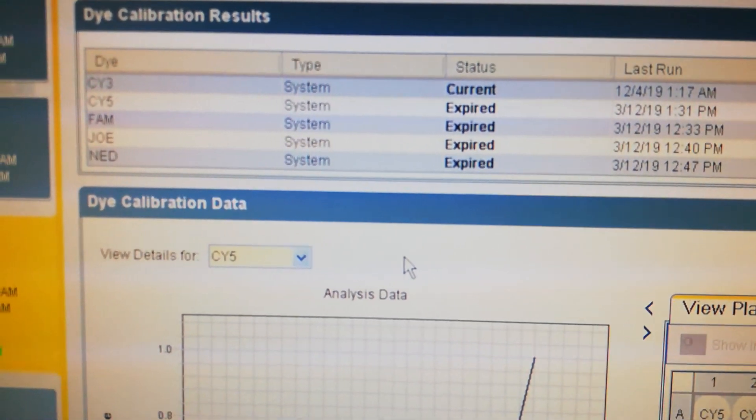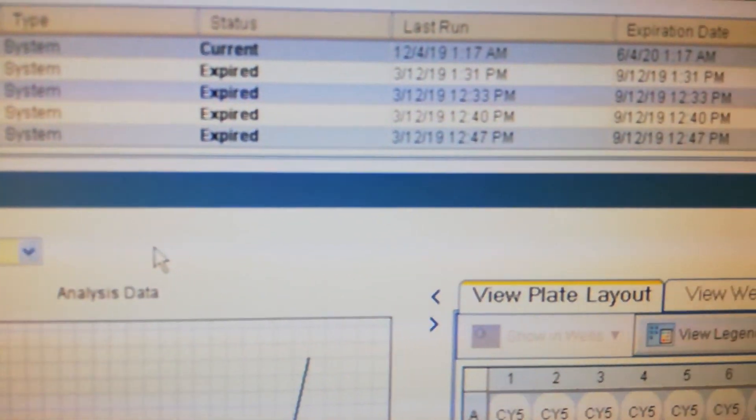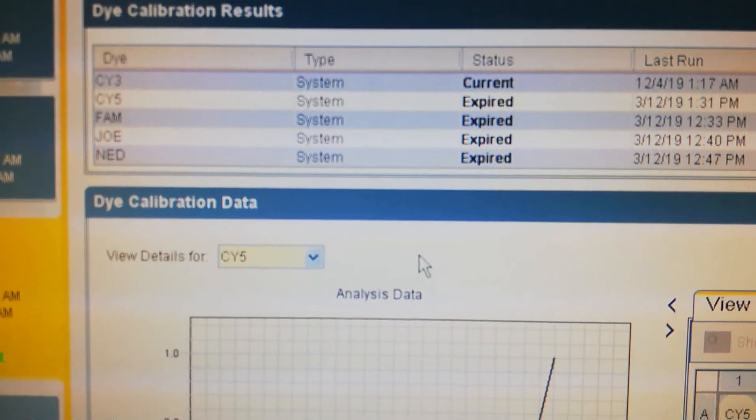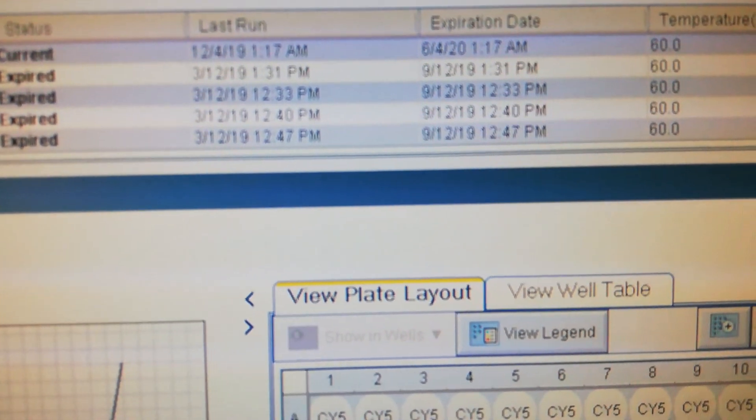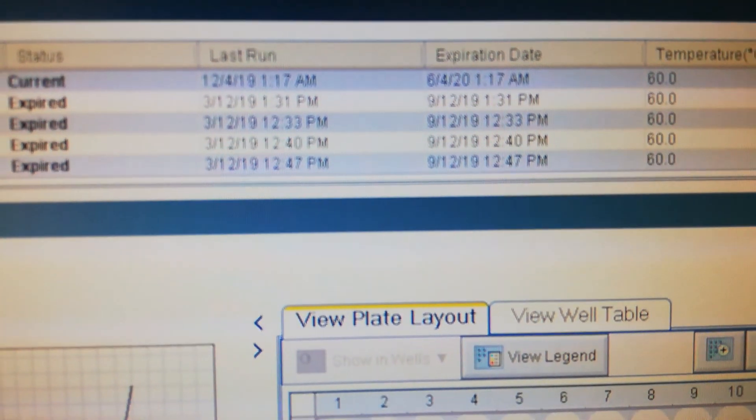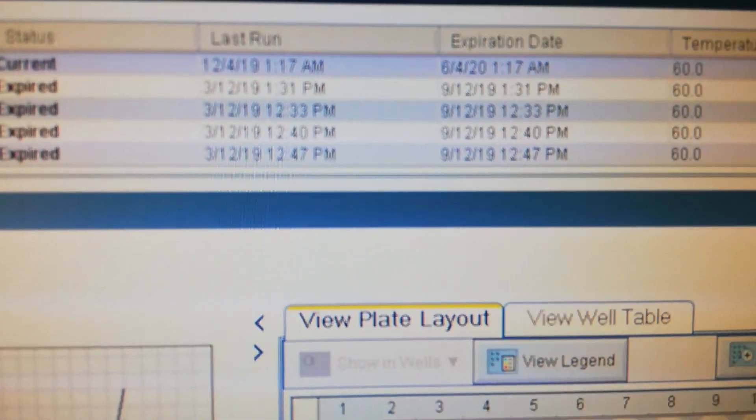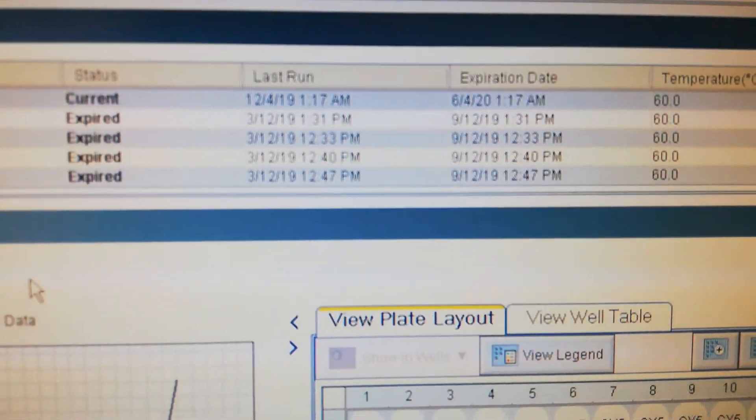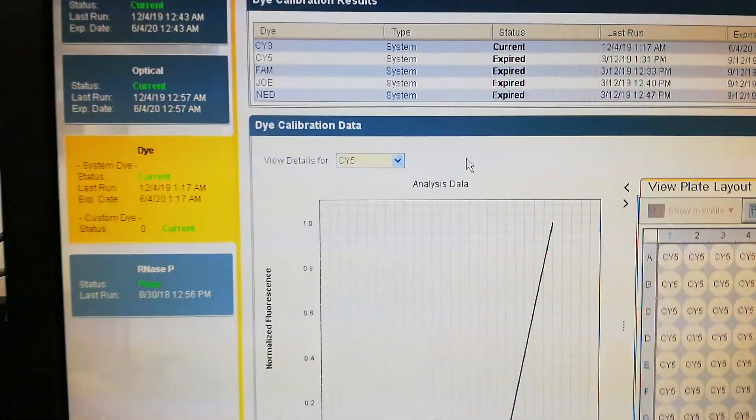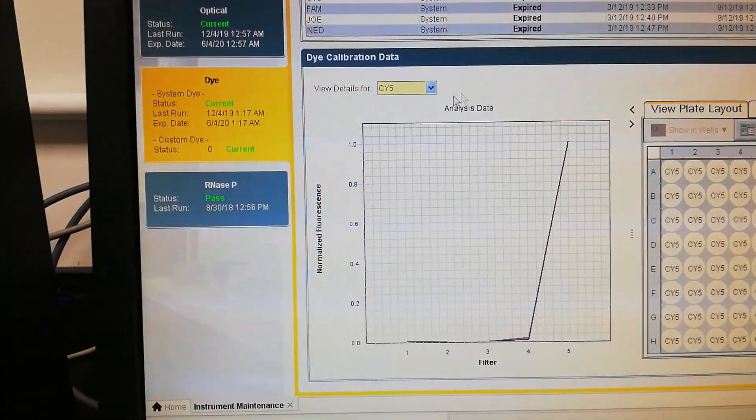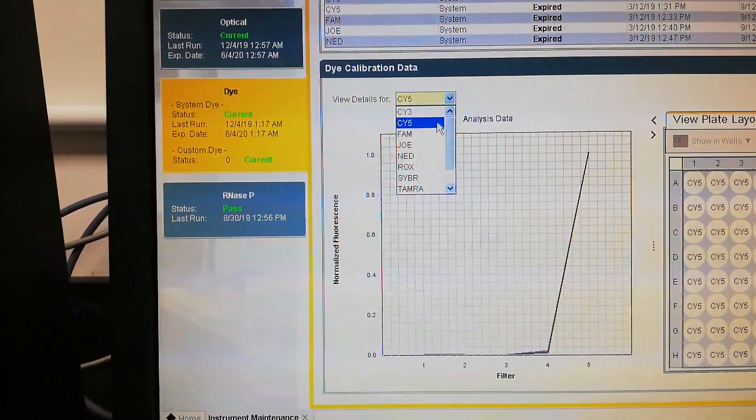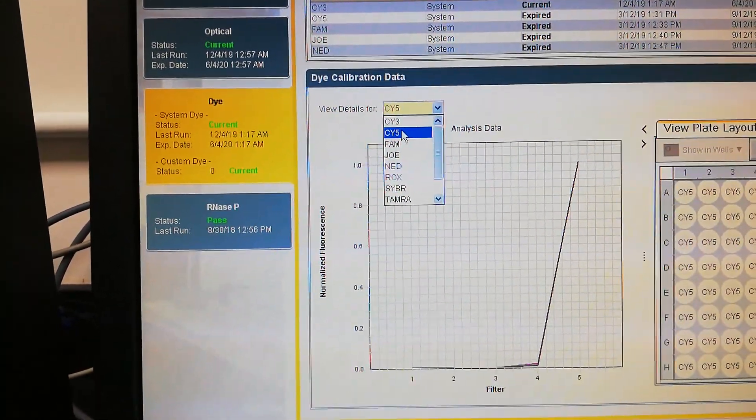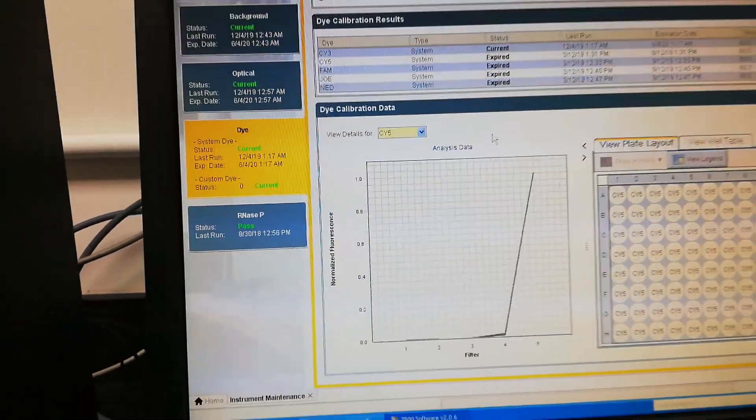This CY5 is expired, about to expire. It is already expired. Now the next one will be to do the CY5. From here, view detail, I will see this CY5 dye.